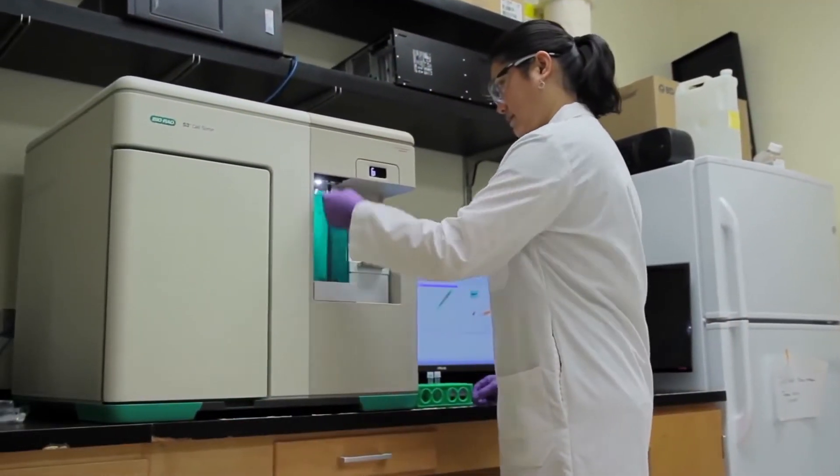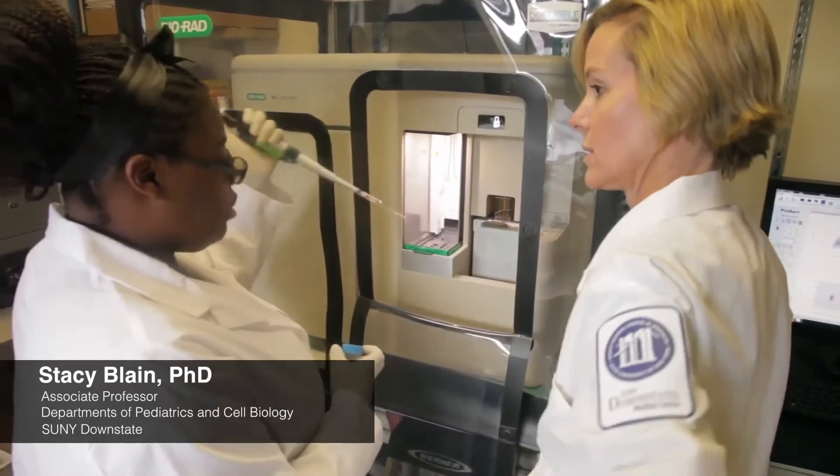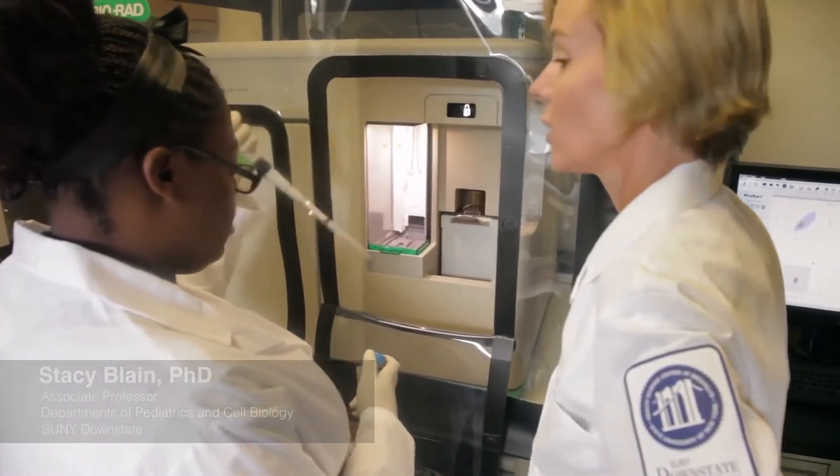With the S3E in your lab, you get the most approachable cell sorting system available to scientists today. So, the S3E is really user-friendly because it's not this huge beast of a piece of equipment. It's not intimidating.